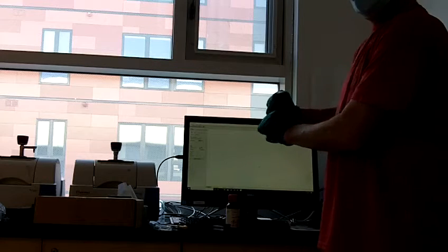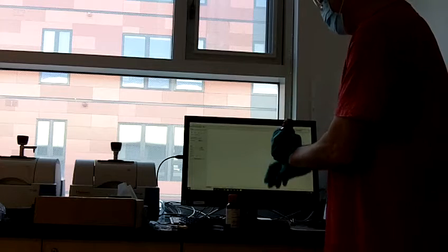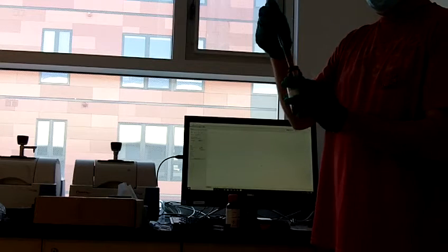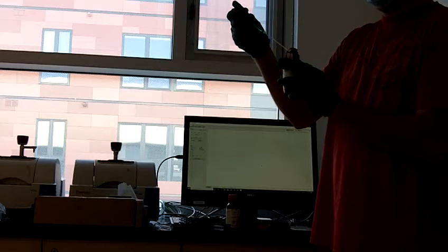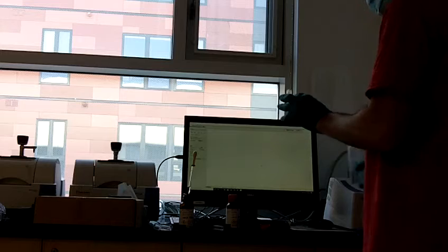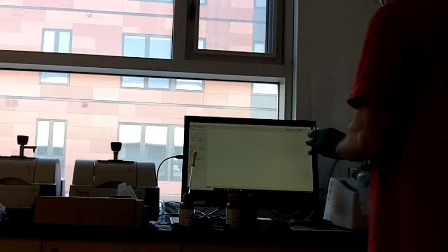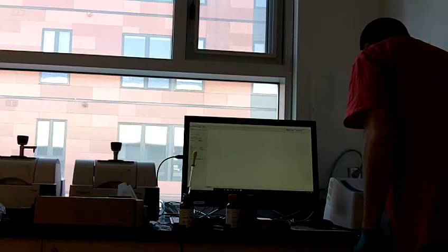Making up these samples is very straightforward. In some situations you might want to do this more precisely, but for the purposes of what we need in this lab, we're literally going to take 1 drop of the terpenine, and then fill the cuvette the rest of the way up with methanol. So this is our alpha terpenine, and we're going to put this in slot 1.